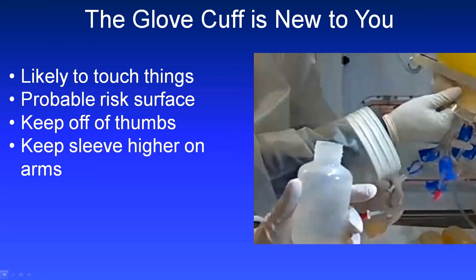And we have a quick maneuver that we'll show you during our live session for getting that sleeve material up higher on your arm and getting it up off your thumbs. But you might want to think about that at other times too, just trying to keep that sleeve material up higher on your arms and keep that cuff off your hands while you're working, particularly for people that have shorter arms like me.